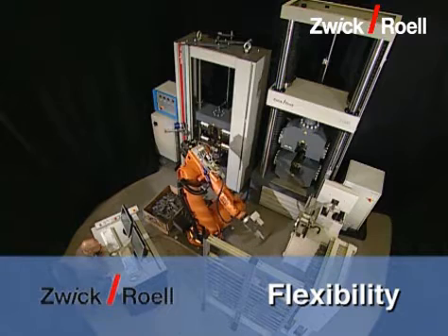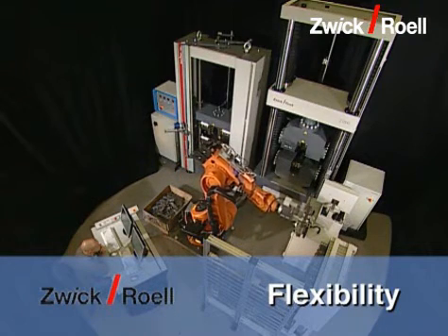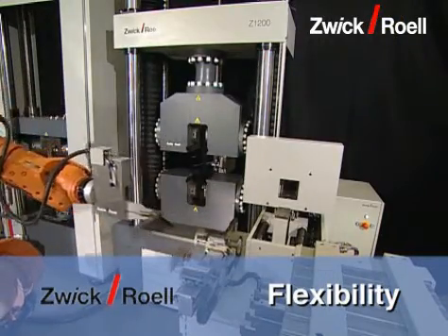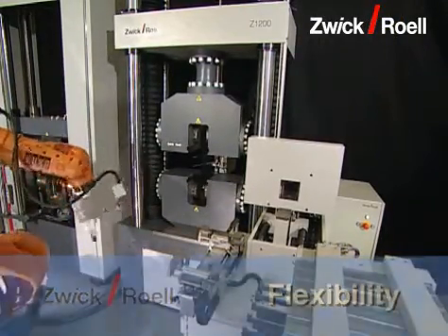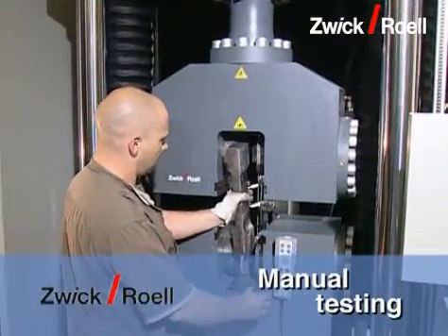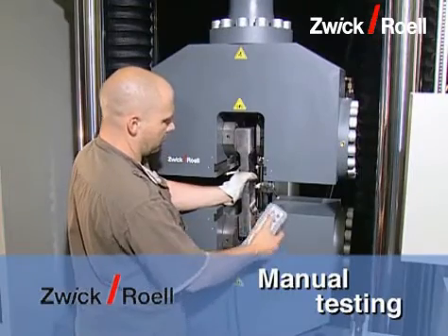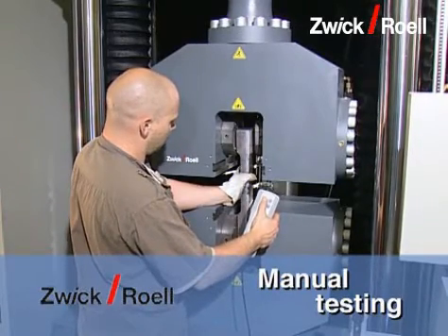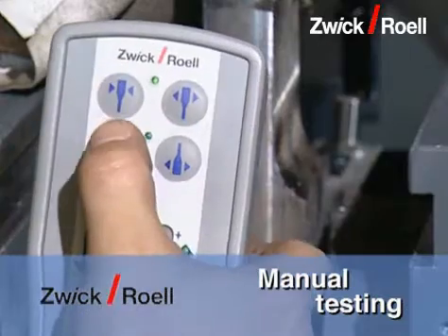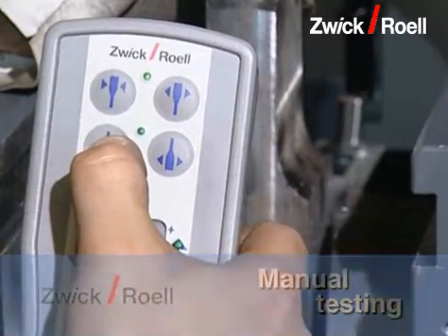Due to the arrangement of the device in a circle with the robot at its center, enlargement is possible at any time. For example, it is no problem to integrate a barcode scanner. With the test system, manual testing is possible at any time and there is no need for retraining, as both manual and automatic operation use the test expert software.